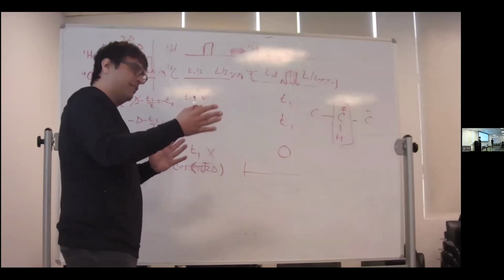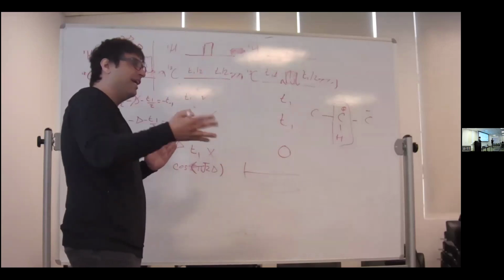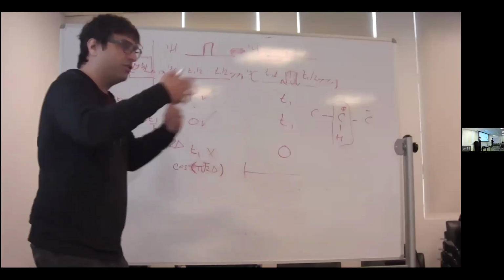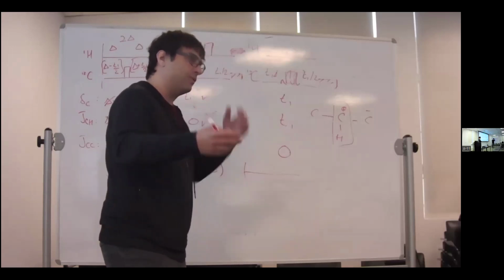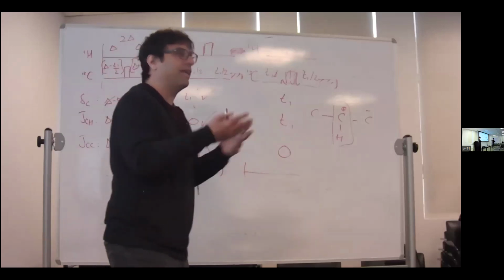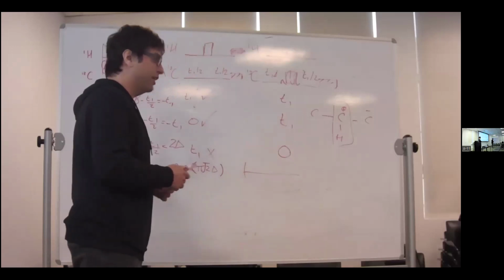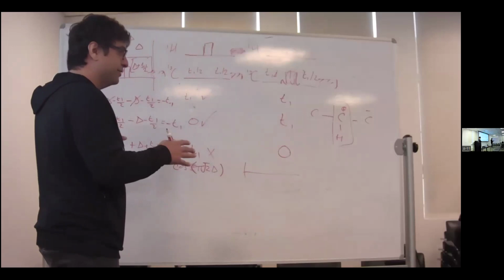This is not a perfect scheme, but you can do this to increase artificially the number of points, to combat the artifacts of Fourier transformation. It's like zero filling, just the need to go to the frequency domain. So there's no way you're gaining anything other than defeating the artifacts that come out of Fourier transformation. All right, this is good.